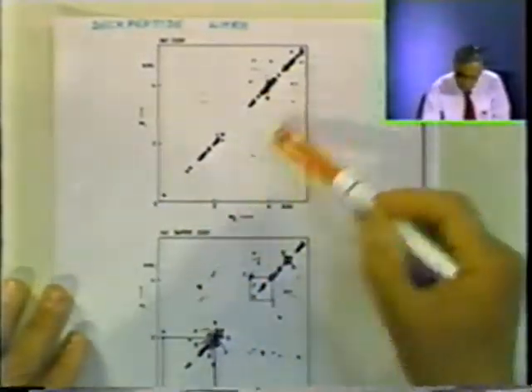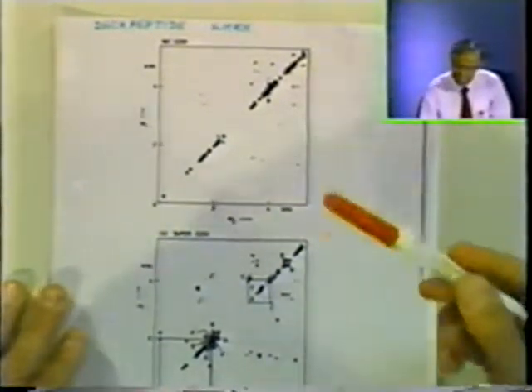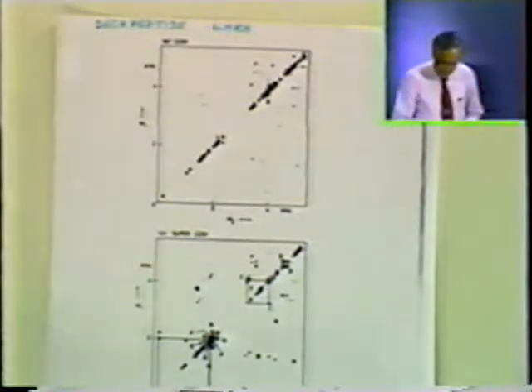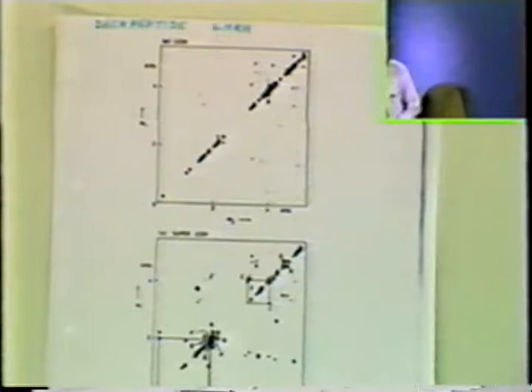They are not noise, they are not dirt from Xerox, they are real cross peaks, even in 20 minutes. With a 23 hertz per point digital resolution.